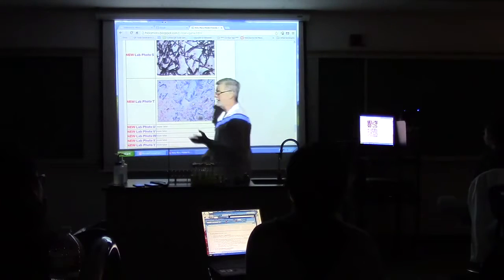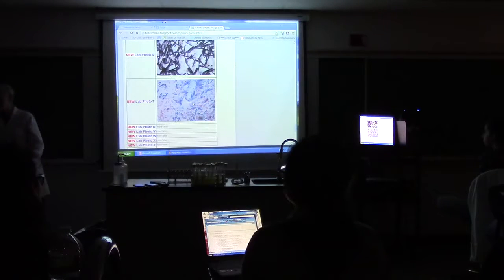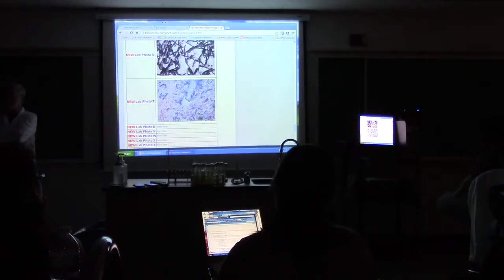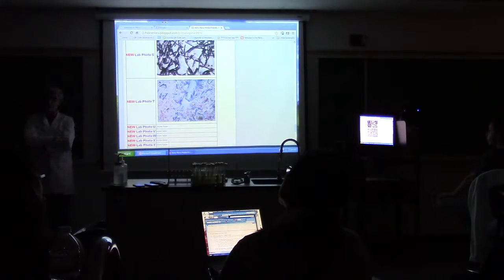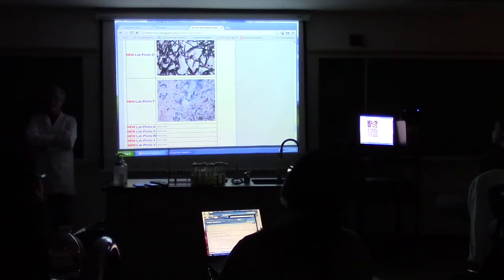Remember how I said if it keeps the first color you put on, it's positive, and if it keeps the second color you put on, it's negative. And for the gram stain, the majority rules, but for the acid-fast stain, one hot pink rod makes it positive. All right. Even today, when you raise your hand and tell me, I want you to say, if you see a hot pink rod, I want you to tell me it's acid-fast positive. But in microbiology terminology, acid-fast positive is not the correct answer.